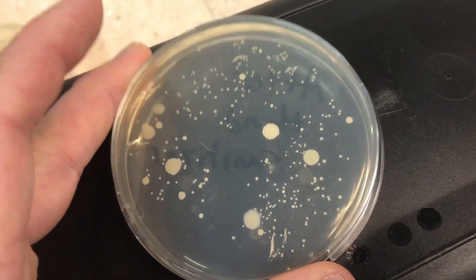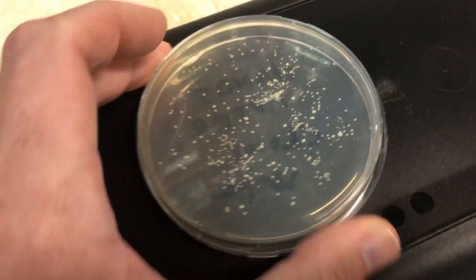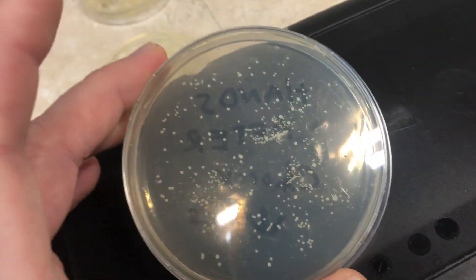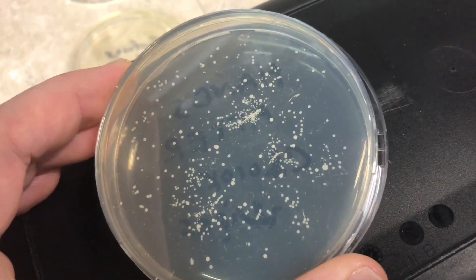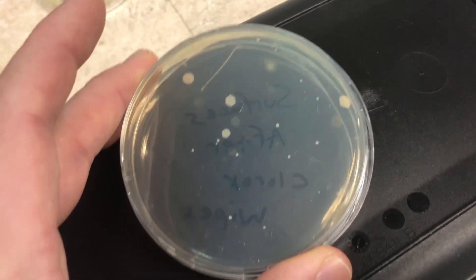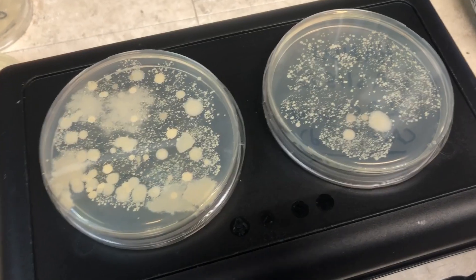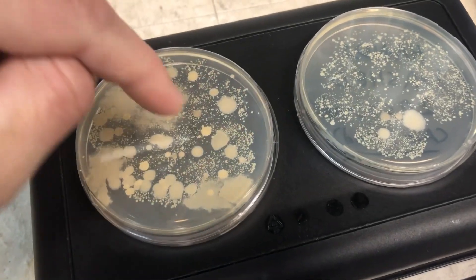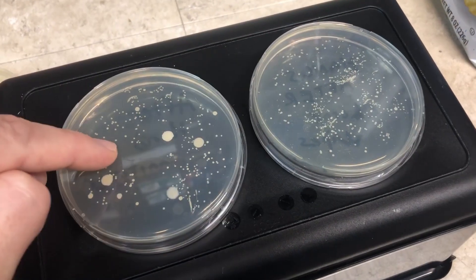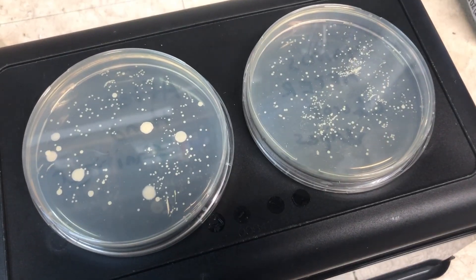This dish is after using the hand sanitizer — still plenty of bacteria. This dish is from wiping with Clorox wipes, and there is quite a bit less bacteria, which is kind of surprising. Last but not least, this is after swabbing surfaces I'd already wiped with Clorox wipes — still plenty of bacteria on those surfaces. Here's a side-by-side of less-than-20-second versus 20-second handwashing, and another side-by-side of hand sanitizer versus Clorox wipes — pretty close to the same.